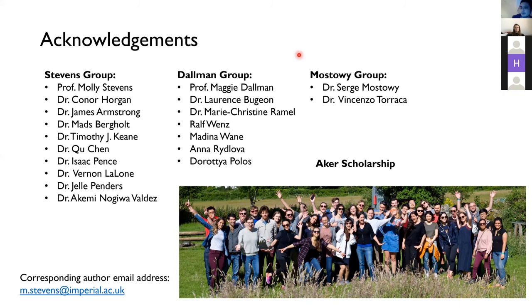I don't think the spatial resolution is the big limitation there. I think the limitation is the sensitivity. This bacterial model worked very well because the bacteria grow in clusters, and that gives a very strong signal, which is easy to detect. The spatial resolution here is similar to what you have for a light microscope, so theoretically, it's down to 0.5 micron.